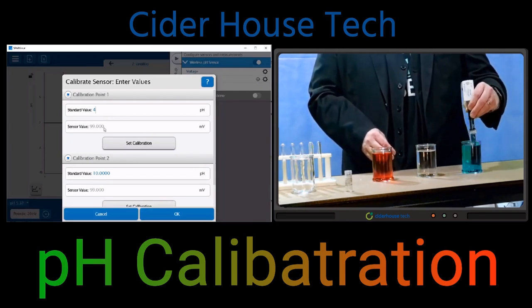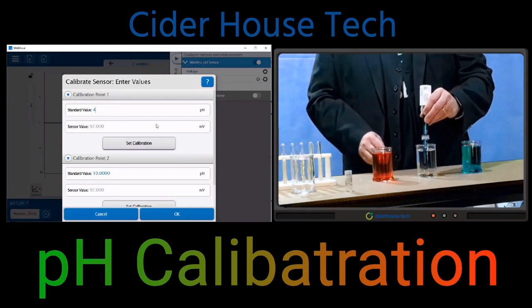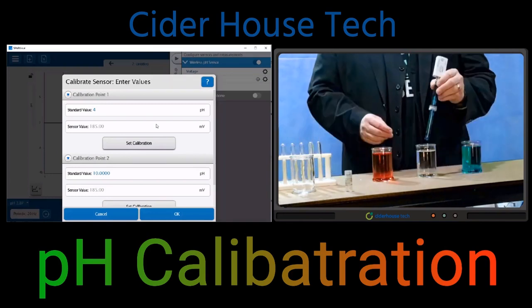Down below, you'll see an active sensor value that's read in millivolts from the sensor. I'm going to place my electrode into my buffer solution. You may have to move the cap for the storage bottle up farther on the pH electrode.